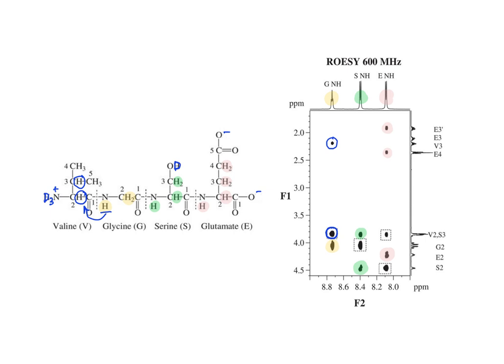Continuing with serine, we can see that the NH of serine now has a new correlation with the CH2 of glycine.